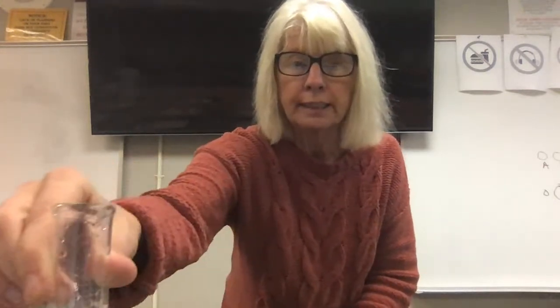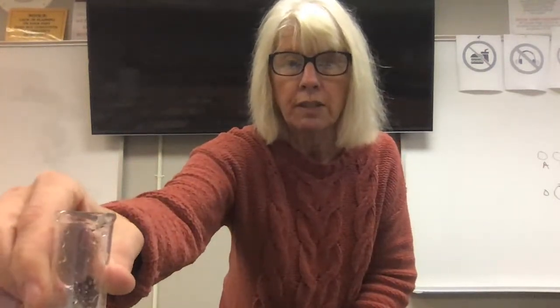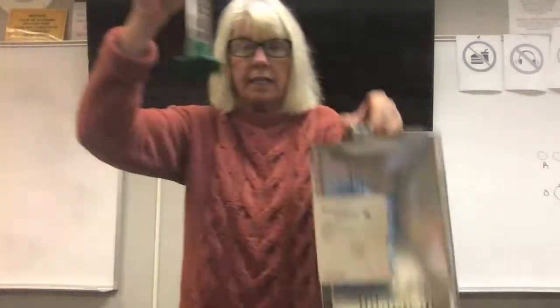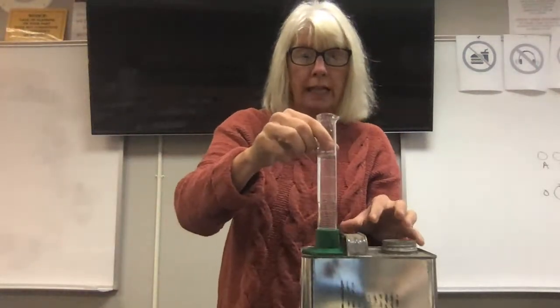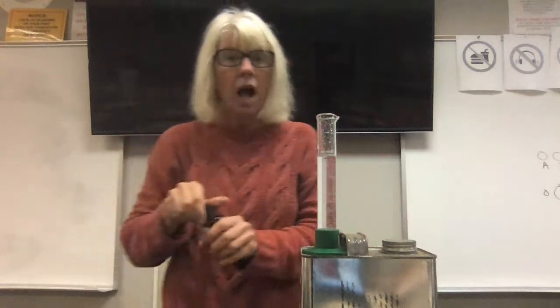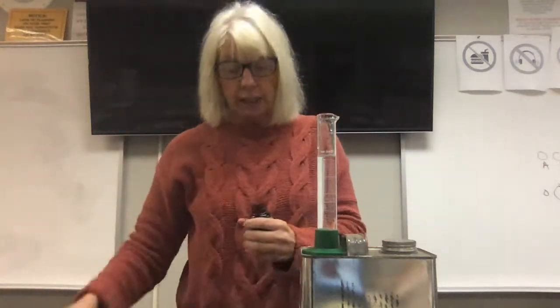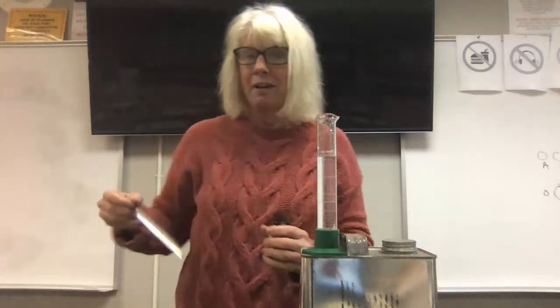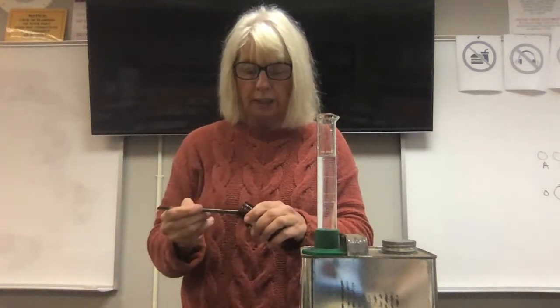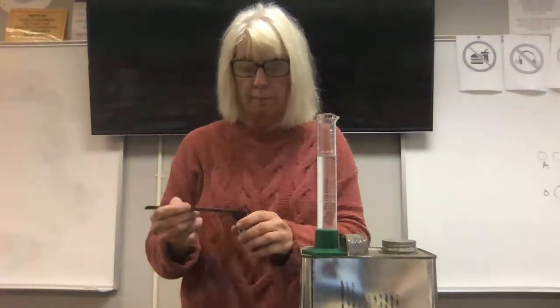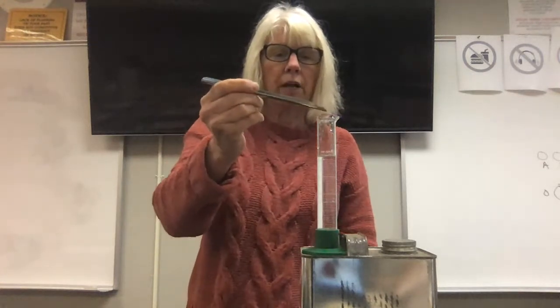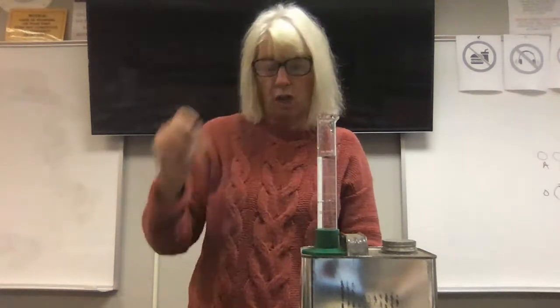I'm going to place this here while I get iodine. Iodine is a diatomic element. Remember, all diatomic elements are held together by nonpolar covalent bonds. So let's see where the iodine dissolves in.